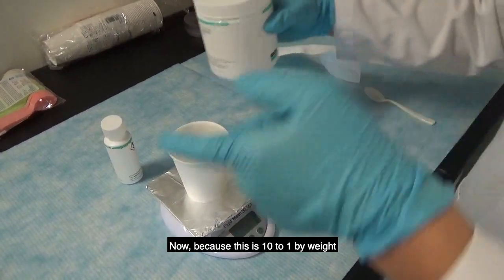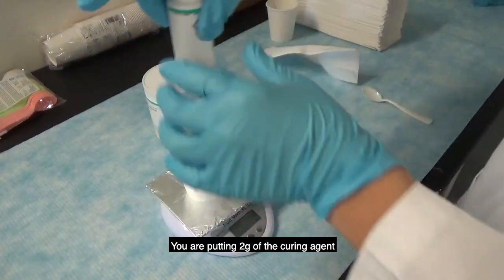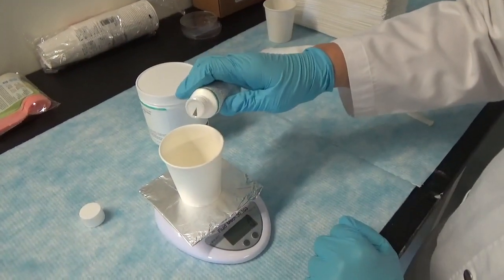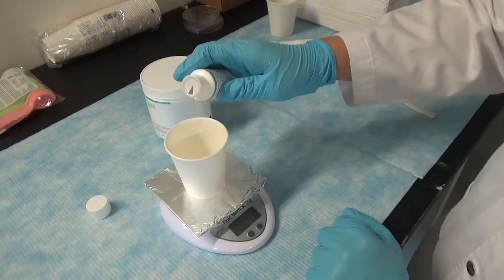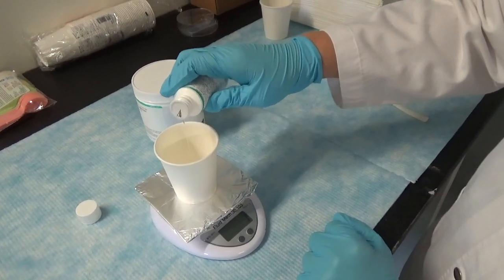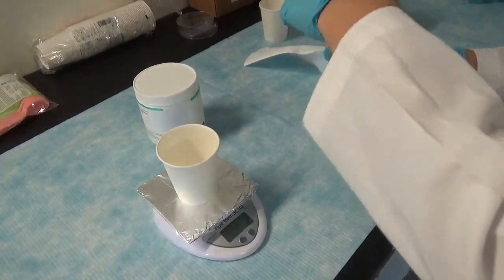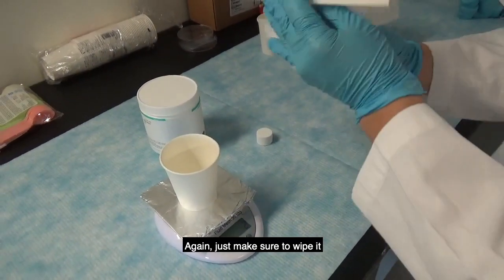Because this is 10 to 1 by weight, you are adding two grams of the curing agent. Add it in, confirm it reads two grams, then wipe the container clean.